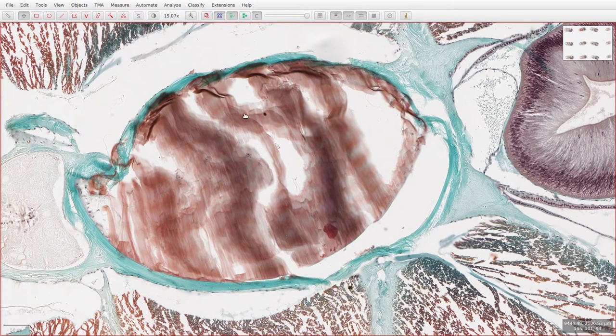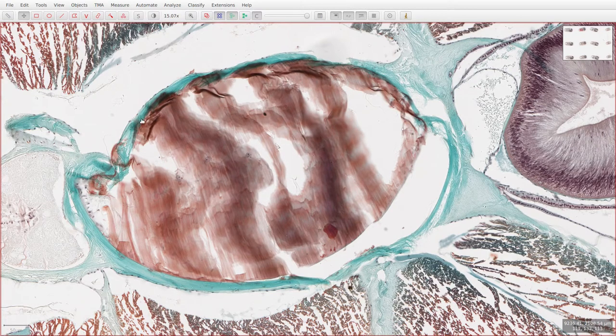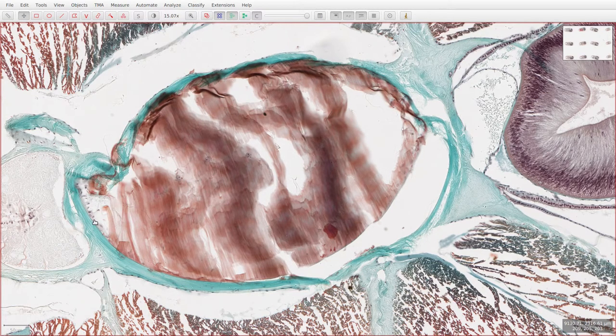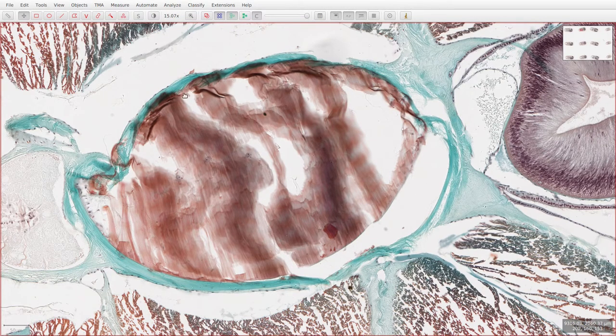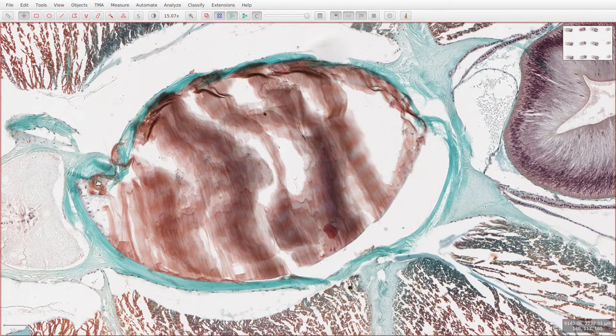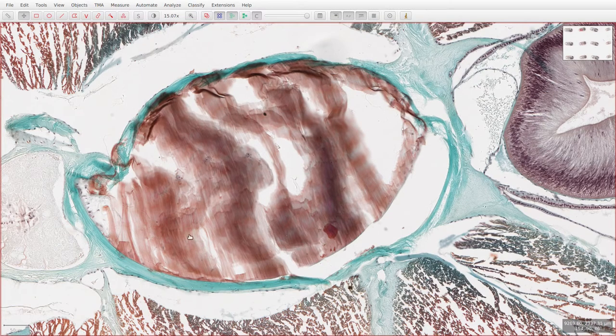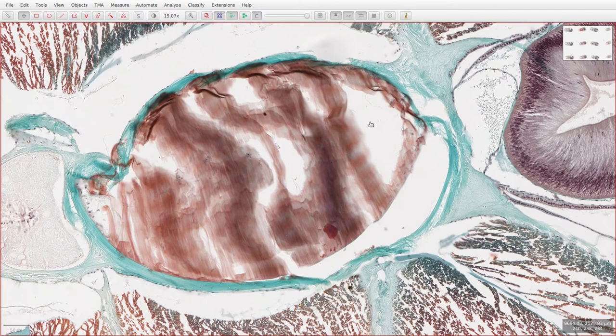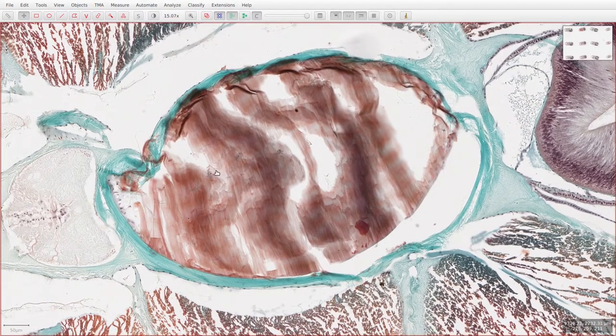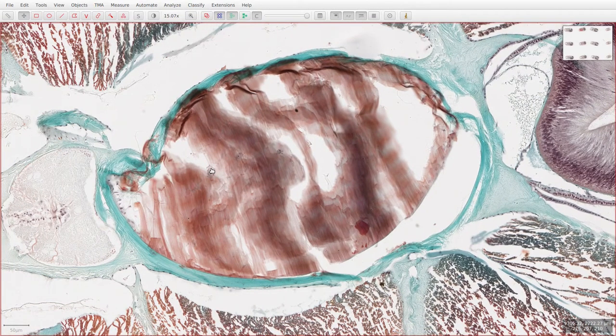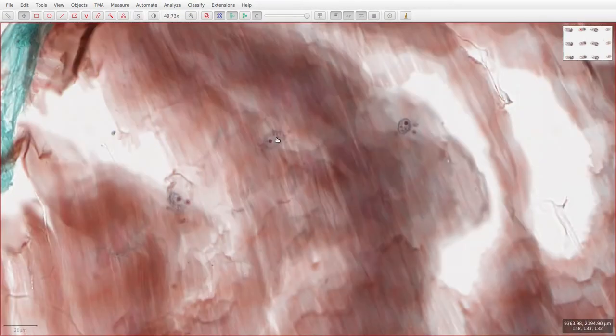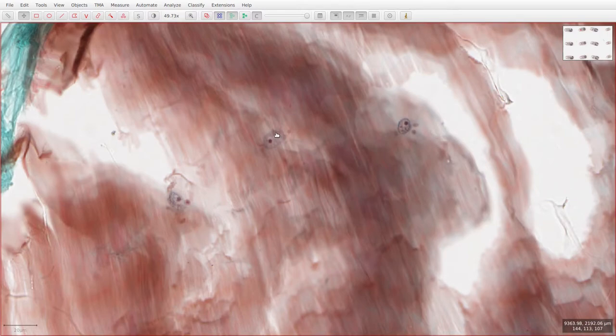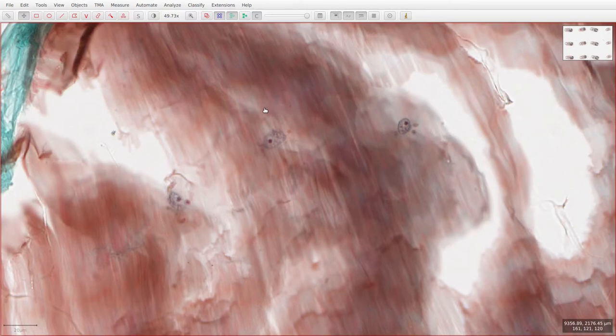In terms of the general anatomy of the notochord, it has a dense, well-developed sheath which surrounds it. You can see it in this blue tissue here. And then within the notochord itself we can see lamellae or sheets of tissue which are formed by these cells here. So here we can see the cells of the notochord. We have a nucleus with a nucleolus in the center, but we can't see any of the cell borders.